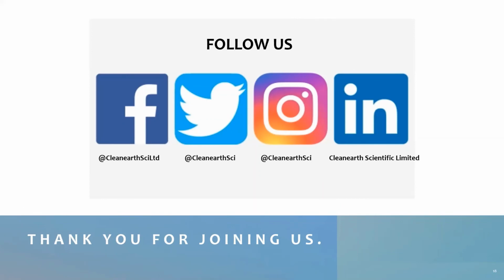Basically, the water system will have some consumables that you will need to change, some after 6 months, some after 1 year, and some after 2 years. For example, the UV lamps are mainly changed after 2 years. For the cartridges, for some systems it is 1 year, and for others 6 months. So these consumables really vary from one system to another. It depends on which system you have, and each system has different consumables.